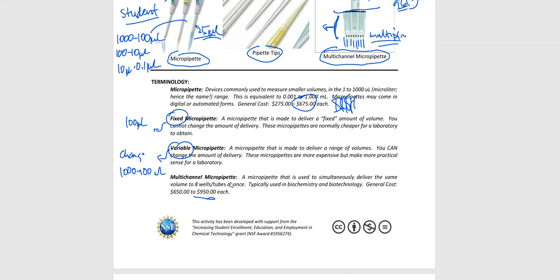So that way you can pull up and you can deliver multiple ones of the same volume at the same time. So yeah, it's going to cost a little bit more money. There's more material and supply, but the top half, which is really where most of the money is going to be located, is really the same throughout the entire thing.